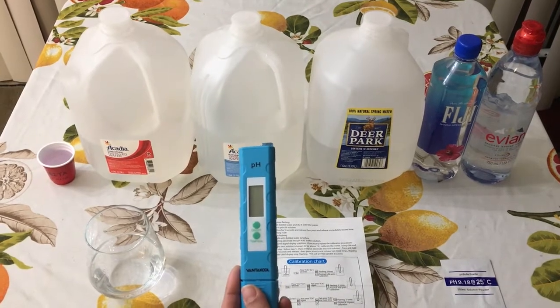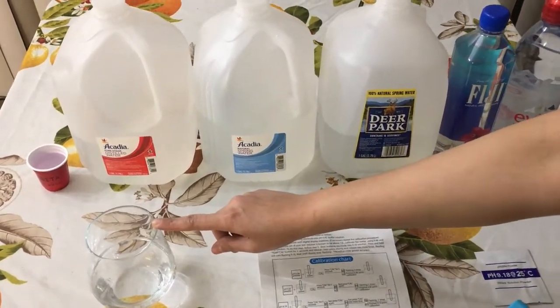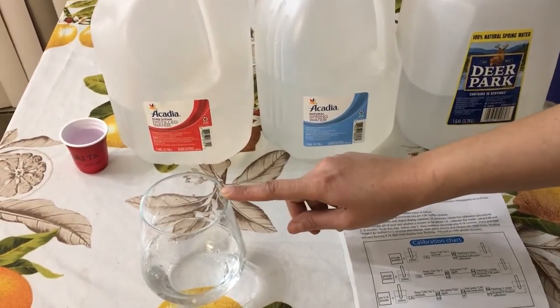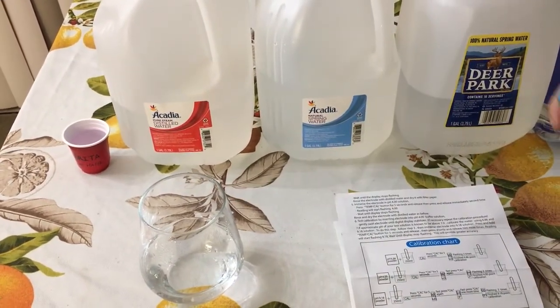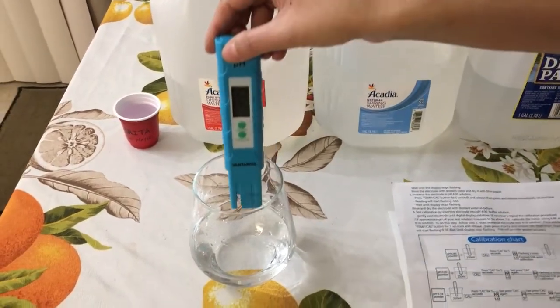Currently this water has a 4.001 solution in it to show you — I can just start my device and dip it into it.